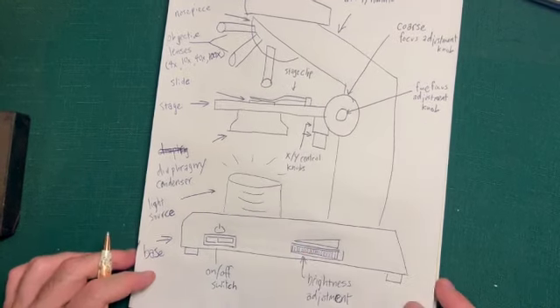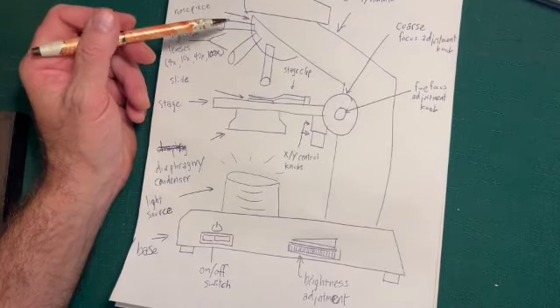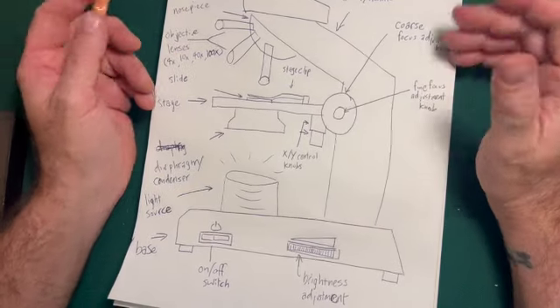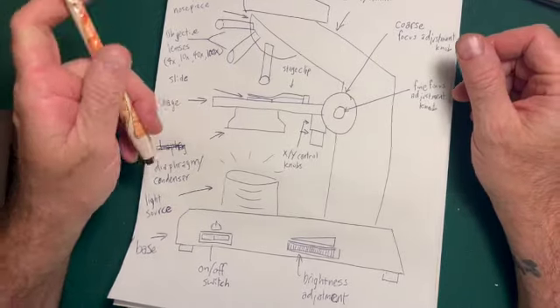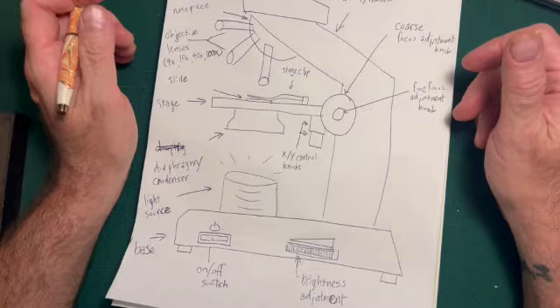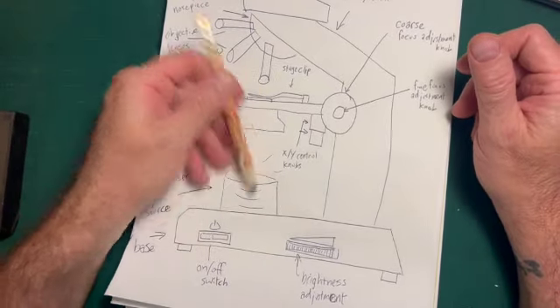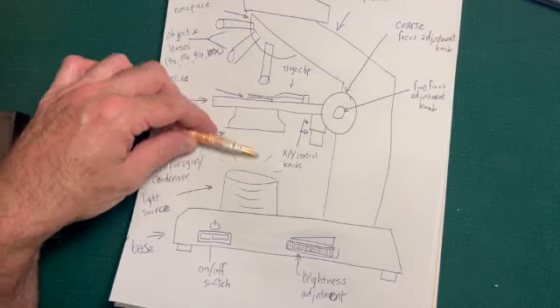So again, at lower magnification, you need less light. If you have too much light, you're not going to have contrast. You're also going to hurt your eyes because remember, when you are shining a light through a microscope, you are effectively shining that light into your eyes, even though there's something in between the light source and your eyes.